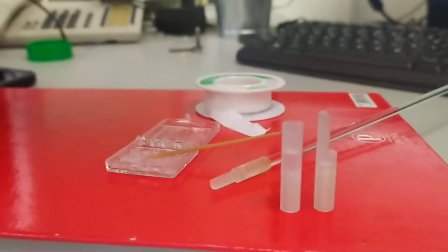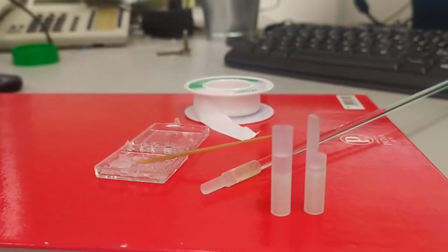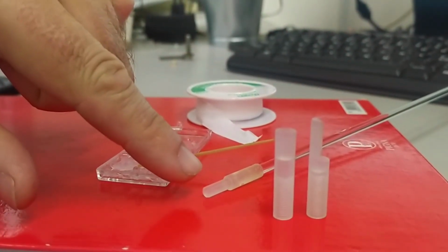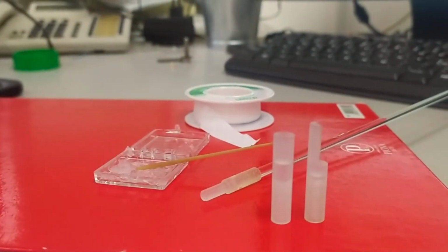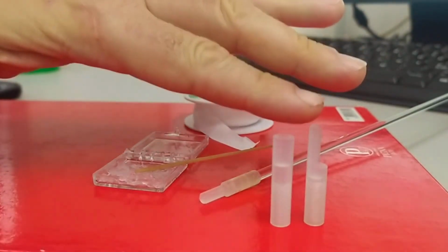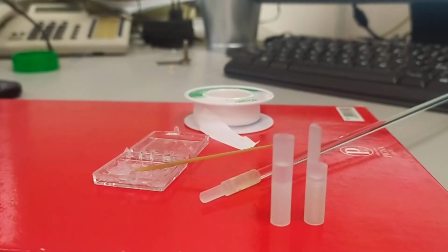The sample holders might be these, but maybe even others that one can prepare directly, which are then screwed at the end of the rod that is attached to the vibrating head. How do we keep the samples in place on the sample holders? Normally there are two different methods.